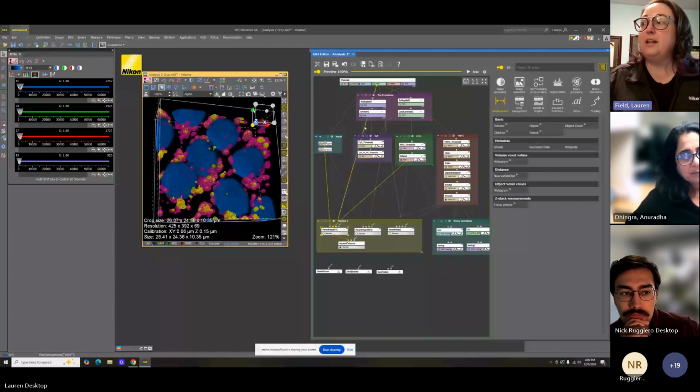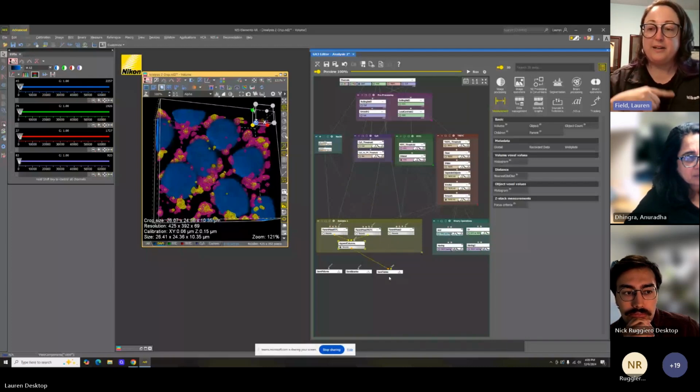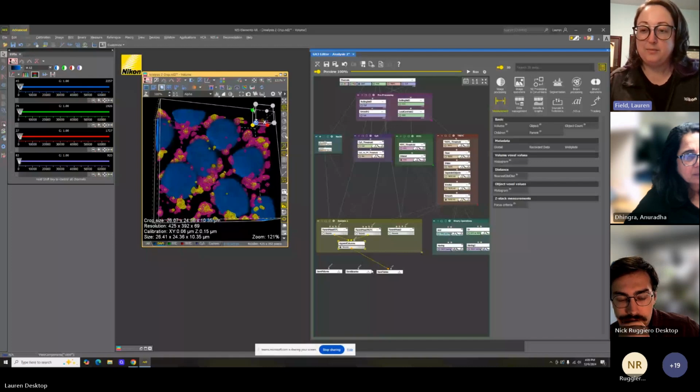And then you can append the columns. So when I run this, I should just get a table out. That's the only thing I've segmented this towards. I don't need any of the internal binaries. I'm not interested in them. And then I wasn't going to do any modification. Like, I don't need the modified images out.